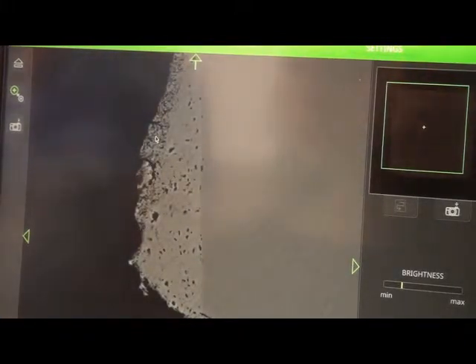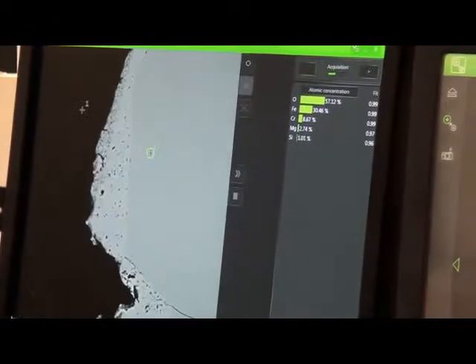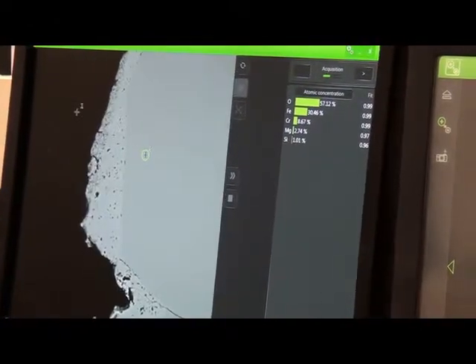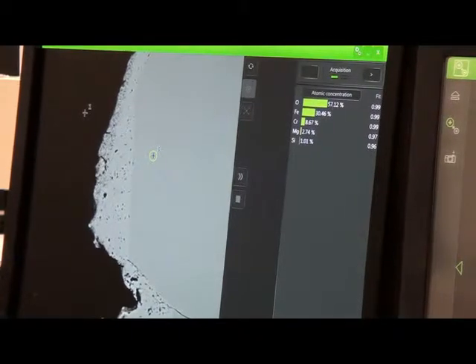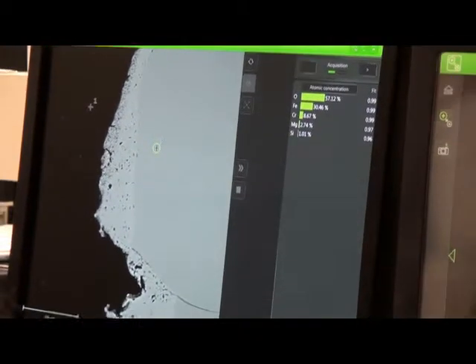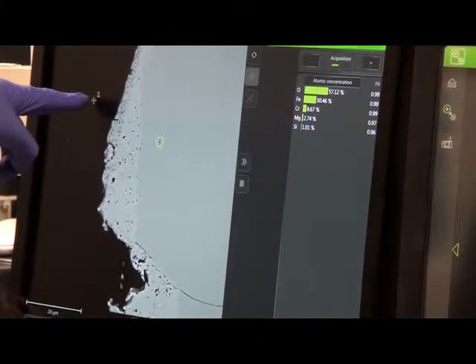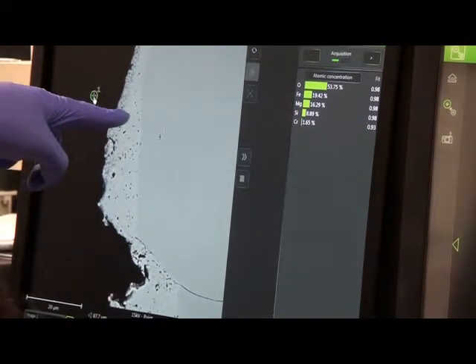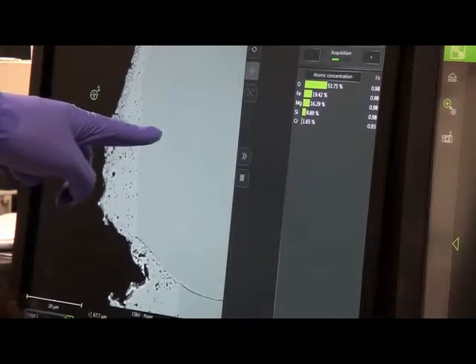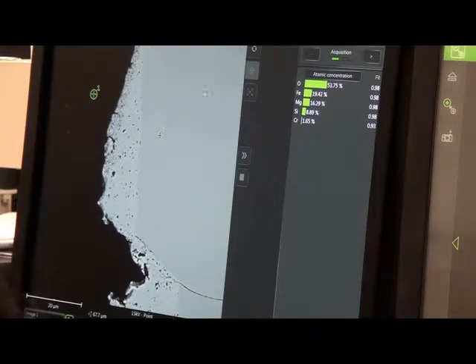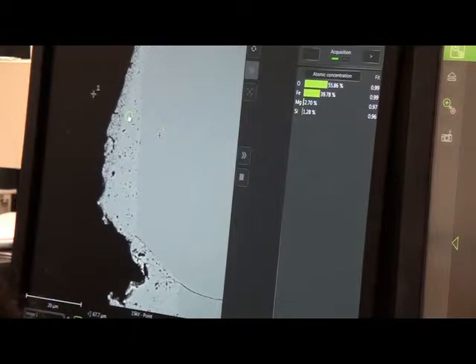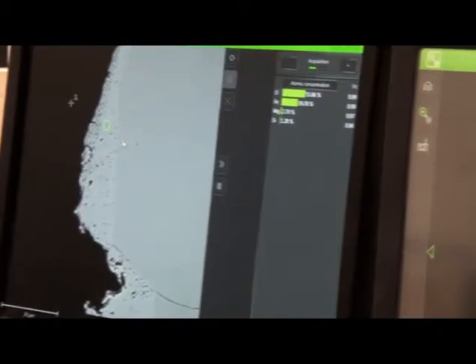Now, if you go to the left screen, click on the first image in the row. I did this before and I chose three spots to analyze, one out here, one in the spongy area, and one in the core. So if you look at the chemistry, you can see, again, a lot of oxygen, a decent amount of silicon.